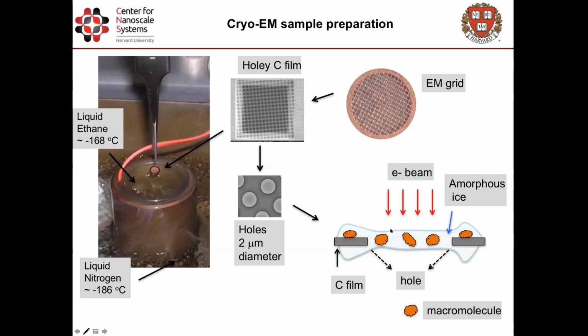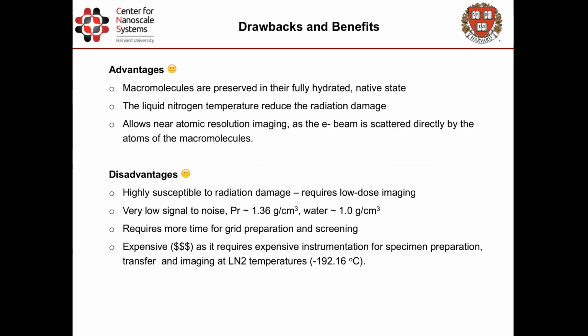Here the sample usually has to be in the holes, and it has to be quite thin, and it has to be frozen quickly in the liquid ethane, so we avoid the formation of crystalline ice. I recently read they said 100,000 degrees per second. My recollection from the Dubochet paper is 2000 degrees per millisecond. This is the rate at which your sample has to hit the liquid ethane, so you don't have crystalline ice. The machines now are sophisticated automatic cryo plungers. We have the Vitrobot. It's very easy to use, and you probably don't have to worry so much about speed, blotting and so on.